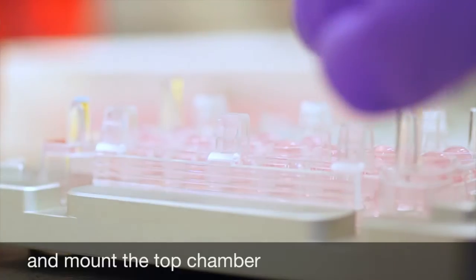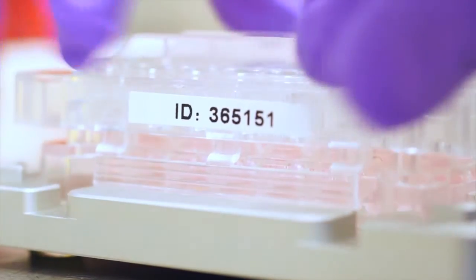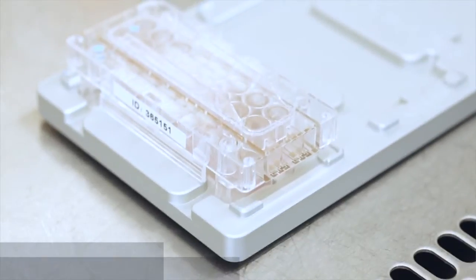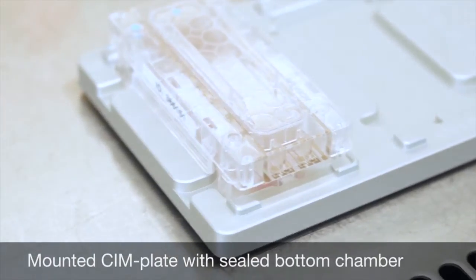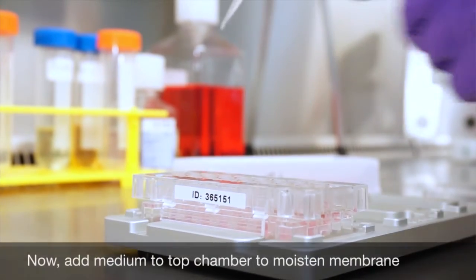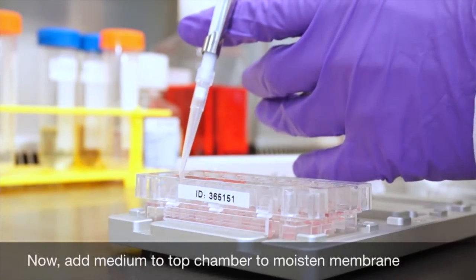Click the top chamber onto the bottom chamber. Add medium without chemoattractant to the wells of the top chamber to moisten the membrane.